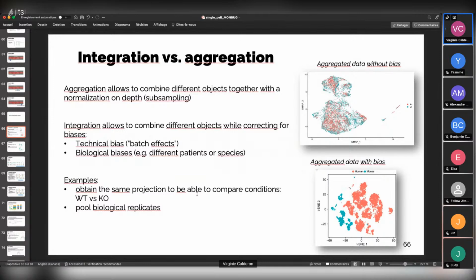So usually we start with a merge in our experience. We use a merge in SNATAC, and then we check if the segregation of sample is done well, or if we can compare the cells together.